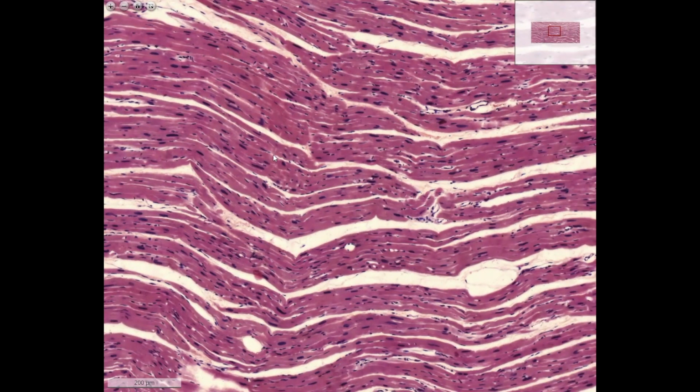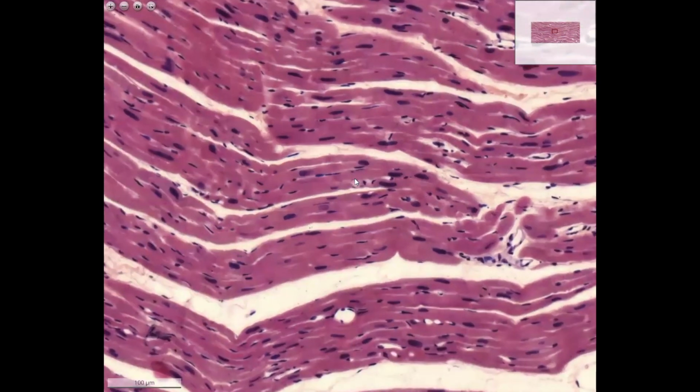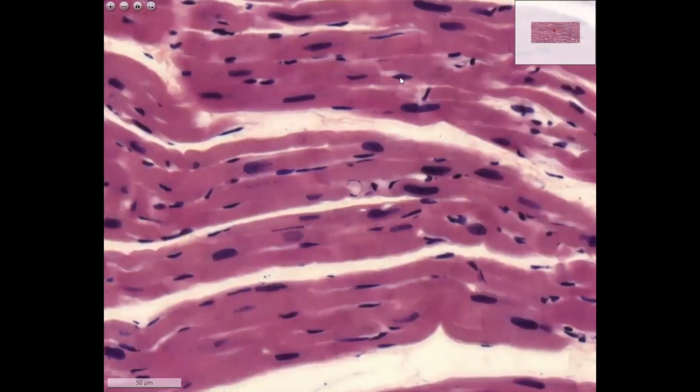Heart muscle cells do not divide after the first years of life. They only do hypertrophy. Due to the hypertrophy, we will get cells which are around 30 micrometers. The range varies from 10 to 50 micrometers in diameter, and the length may be about 100 to 200, 250 micrometers. The cells are connected with the so-called intercalated discs.